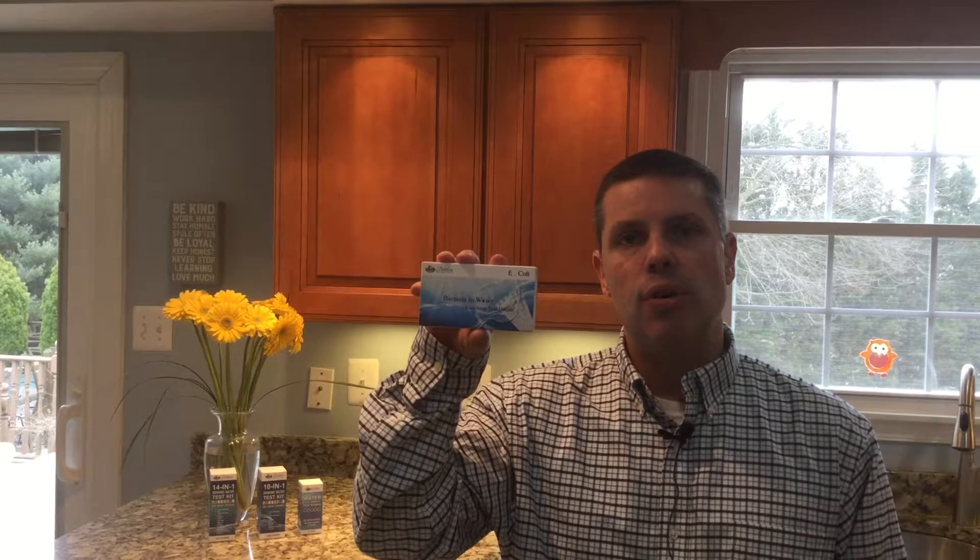Hi, this is Dave from Baltimore Meadows, and today I'm going to show you a video guide of how to use our new bacteria in water E. coli test kit.